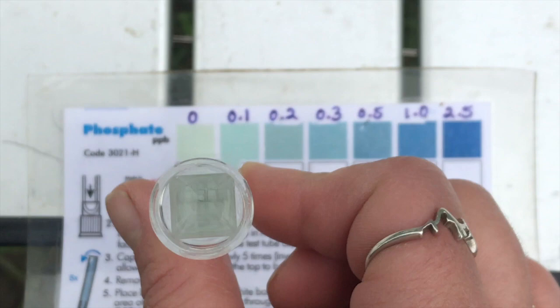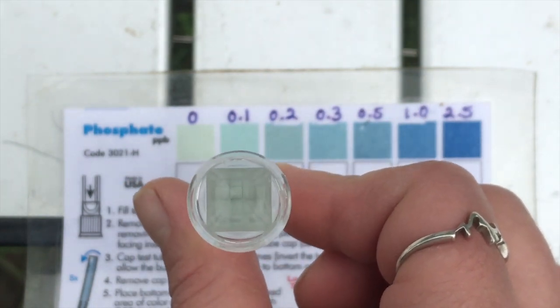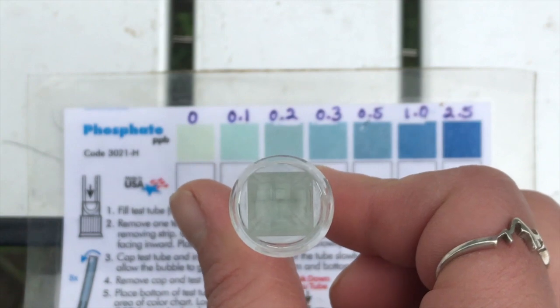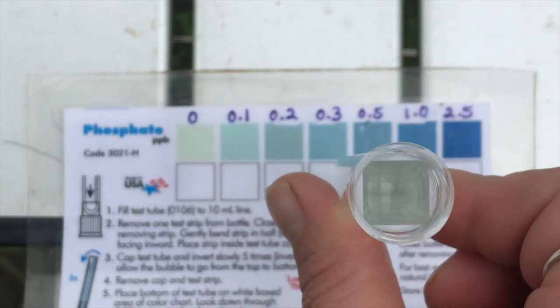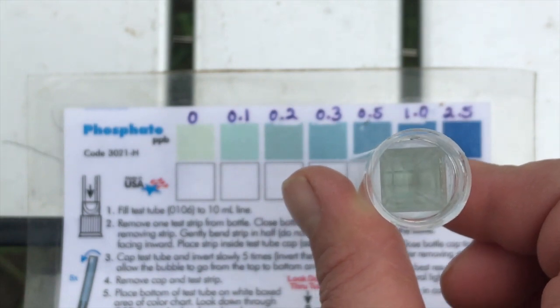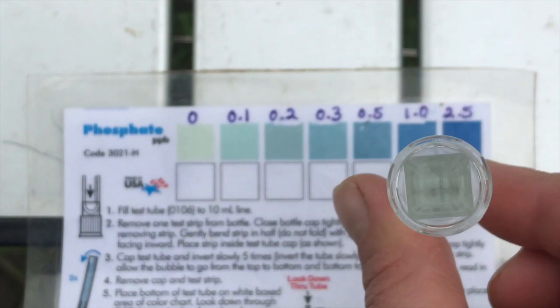Moving along the standard, we can compare the color of our sample to determine the level of phosphates currently present in Jones Creek. It looks to me we've got a reading of 0 parts per million, but 0.1 would be an acceptable reading as well. Moving further along, it's clear our phosphate level isn't as high as 0.2 or 0.3 parts per million. Please record our results and determine whether we met the Salmon Standard.